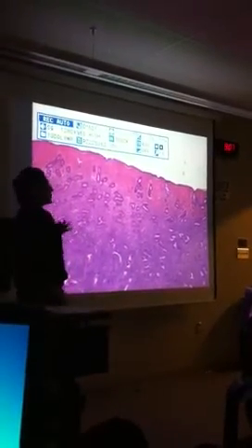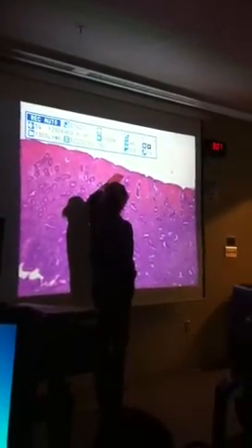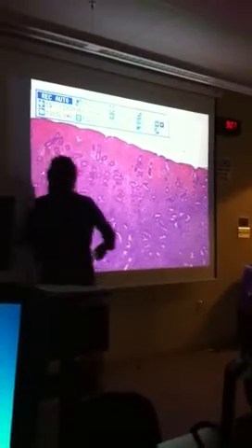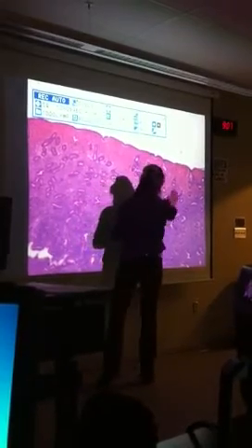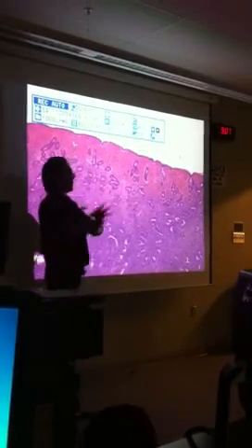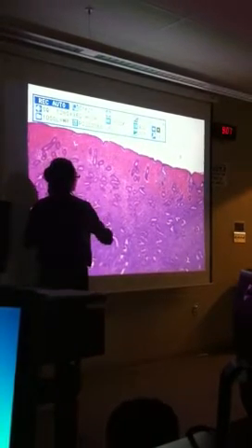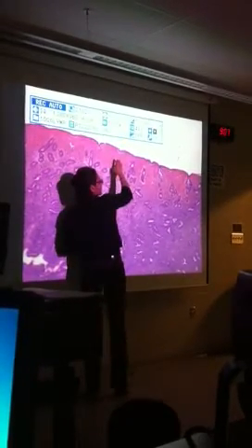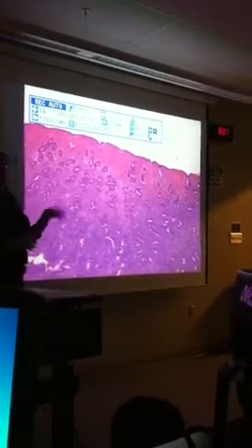So during menses or menstruation, this part of this endometrium, except the very deepest layer, sloughs off. And that's what menses is, essentially. So this would be the endometrium. You can see there's lots of glands in here. And those glands form as we get deeper into the uterine cycle in the month. And these glands are going to secrete nutrients so that if we do have implantation into the endometrium, these glands are going to release nutrients that are going to support that developing embryo.